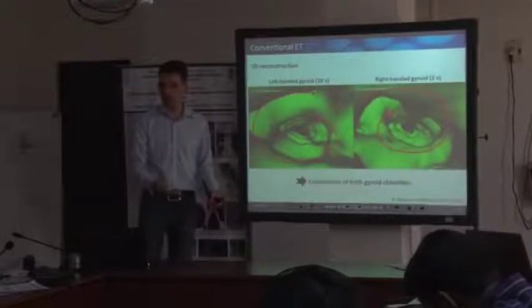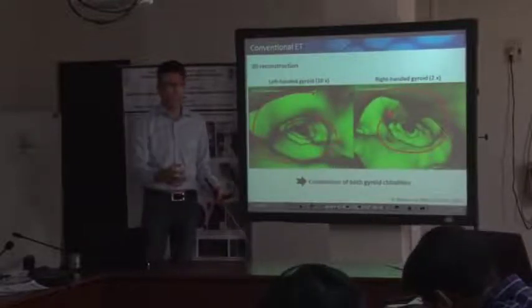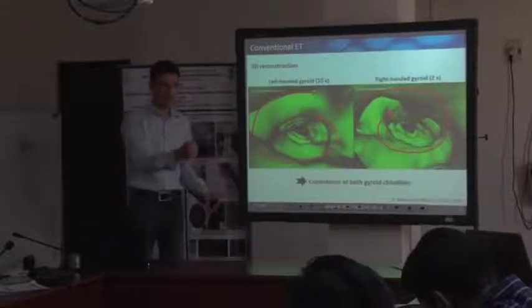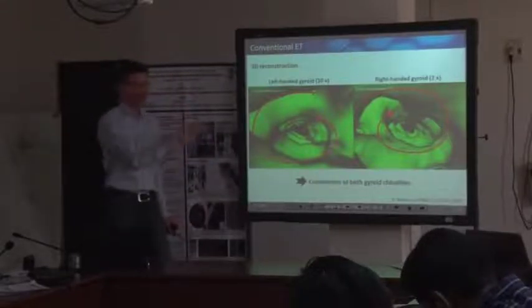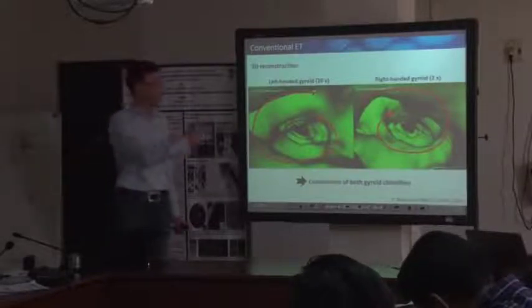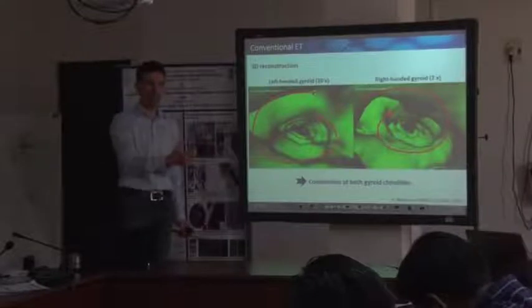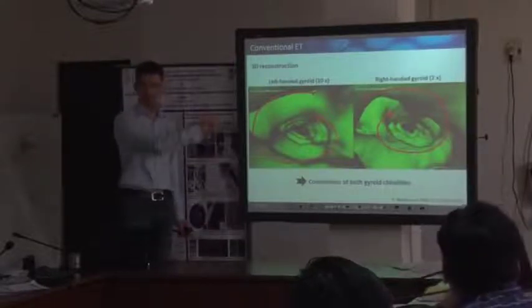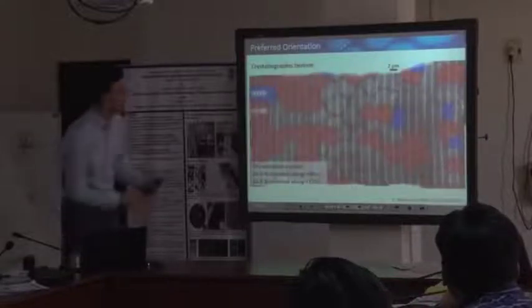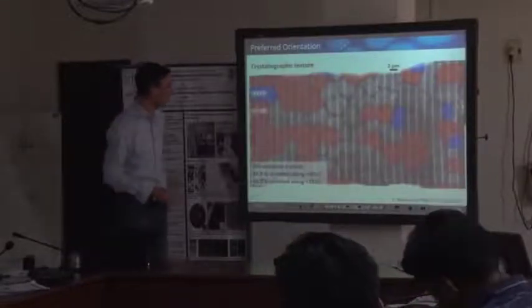If you do a measurement using a microscope in reflection mode, with a very fine light optical beam, then you can do those experiments and attribute, let's say, the polarization of the light from an individual photonic crystal. And you can do a little bit more. The scanning theory is pretty easy.